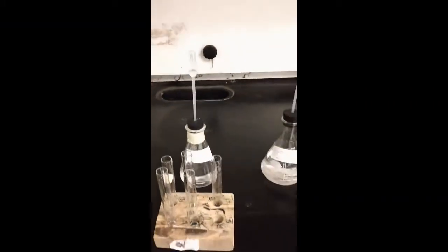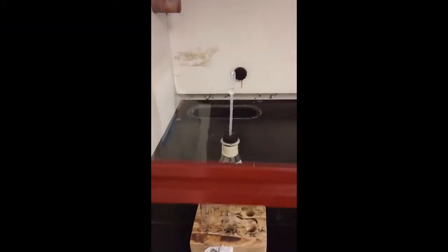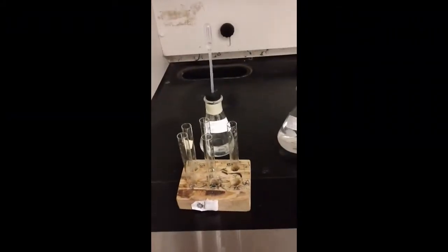For the sake of the camera, I'm going to do it with the hood partially raised, but when you're working in the hood, you need to make sure that you pull it down over. So here I'm going to do it raised just because of the camera. I'm going to double check I have NH4Cl.